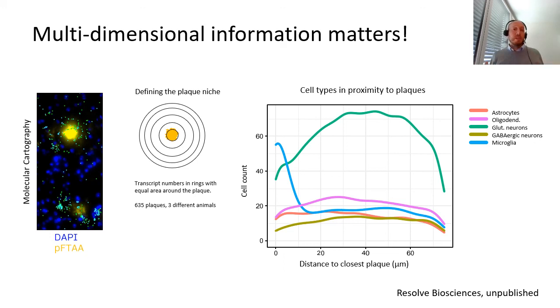However, though we still think that this data is of really high quality, upon analysis we asked ourselves how much of a problem it really is that we lost all the information in the z-plane and have no way to determine whether the cellular distance to a plaque in the xy direction is also true in z. So in order to be sure about our findings, we would need a thicker piece of tissue and overcome all the challenges that come with it.